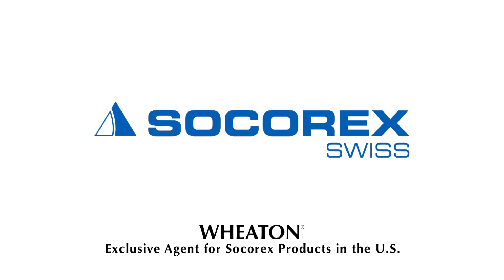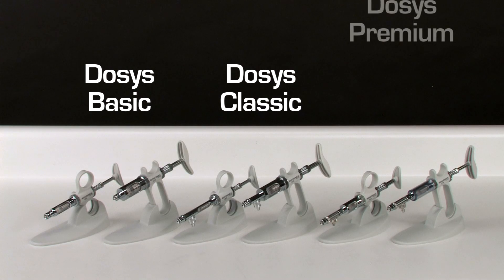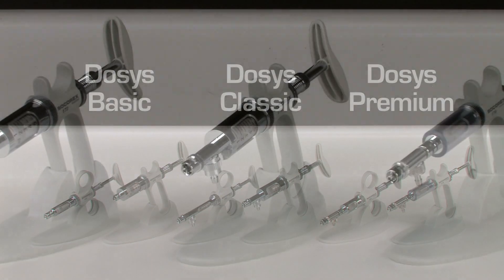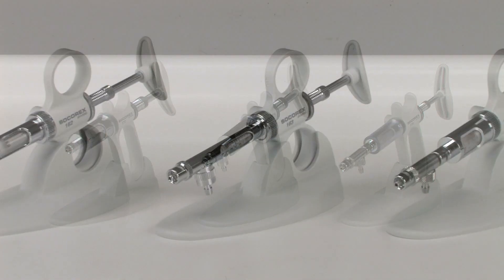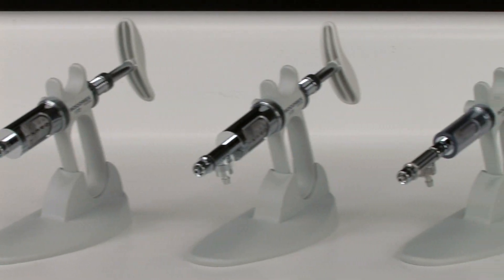Socorrex Dosus Laboratory Syringes. The Socorrex Dosus line of syringes can be used for a wide range of dosing applications around the laboratory. The Dosus line of positive displacement syringes is available in three models. Each model is available with either a two-ring handle or a pistol grip handle.